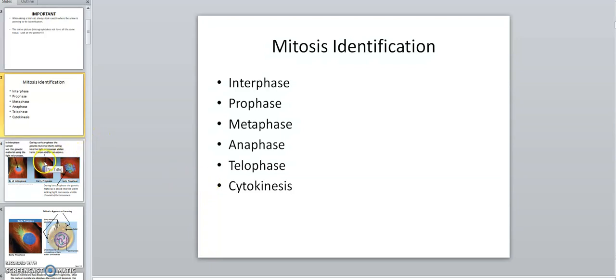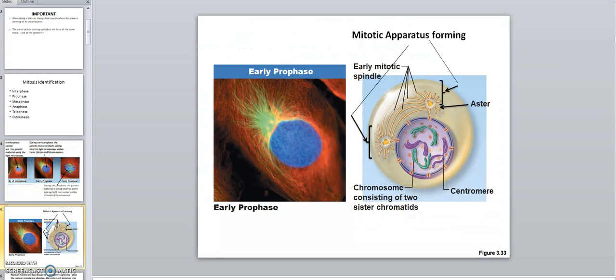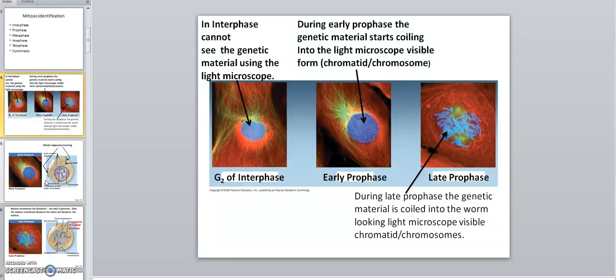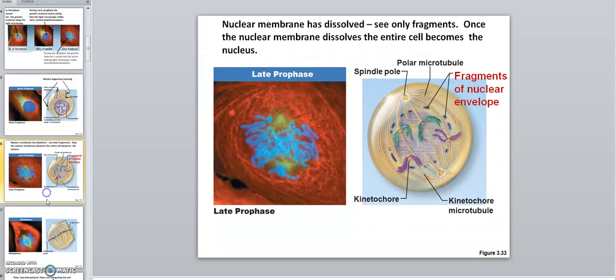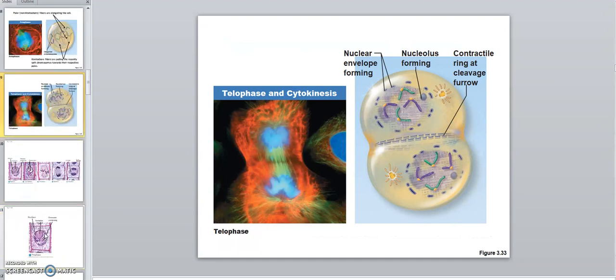So here, you can go to, this would be Microscope Lab, and this will be in my PowerPoints. Okay, a new one I'm putting in. All right, so you can walk through and look at all of these particular pictures and figure out what each stage is. Just read through everything.